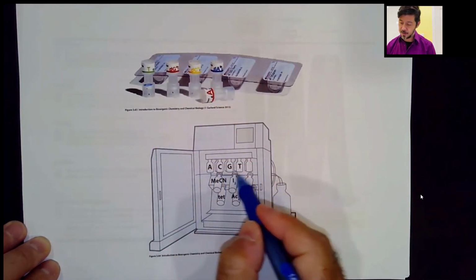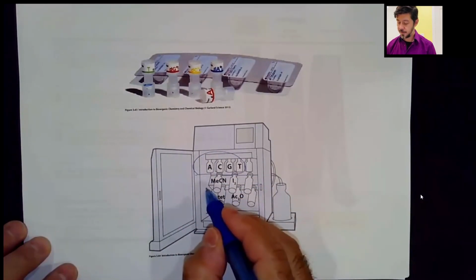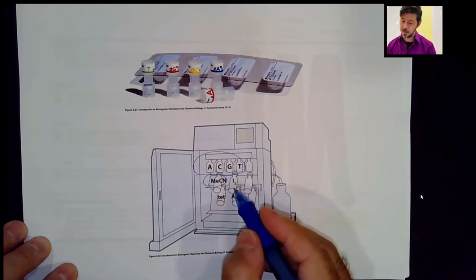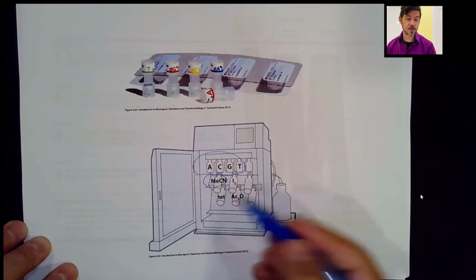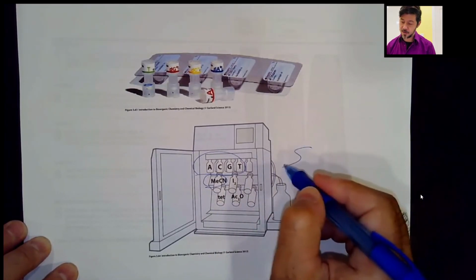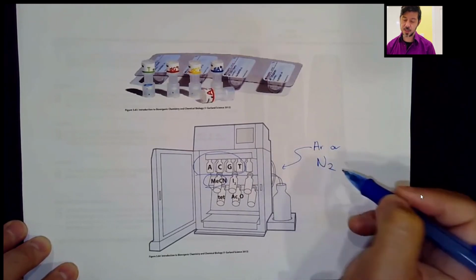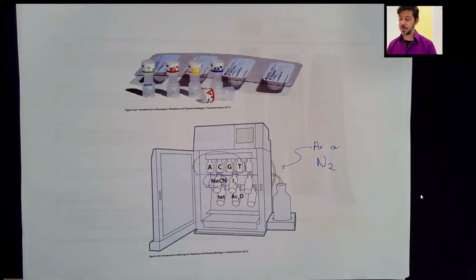And then you have vials here for all your phosphoramidites that you can purchase. And then you have solvents like acetonitrile. Again, it has to be anhydrous. Iodine, acetic anhydride, tetrazole, your coupling agent. And then this is always done under argon or nitrogen gas, okay, to keep it under an inert atmosphere.